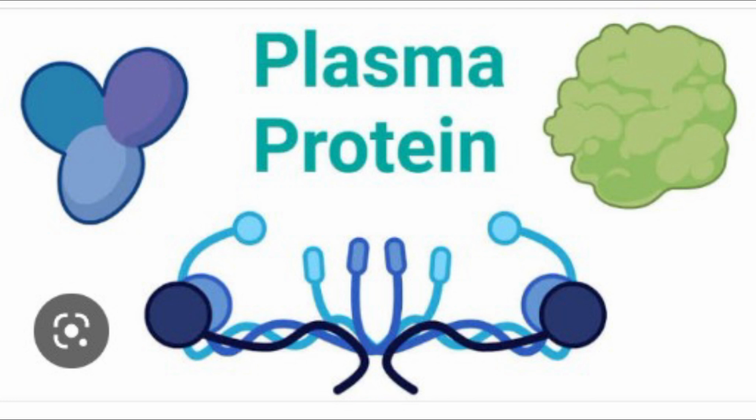Pauly test. This test detects the presence of tyrosine and histidine. Procedure: 0.5 ml of sulfanilic acid, 0.5 ml of 0.5% NaNO2 and add 1 ml of unknown solution. After 1 to 2 minutes, mix and add 10% sodium carbonate. Mix again and observe for the color. Red color appears if the unknown solution contains tyrosine or histidine.